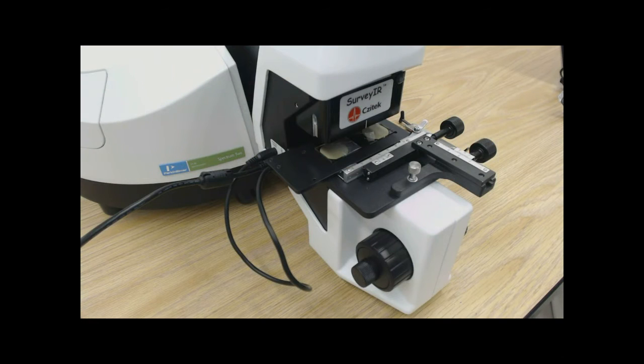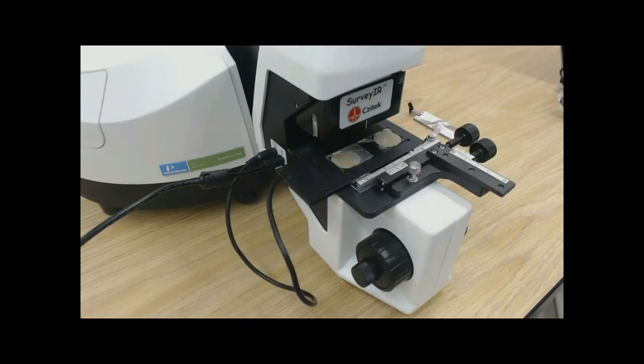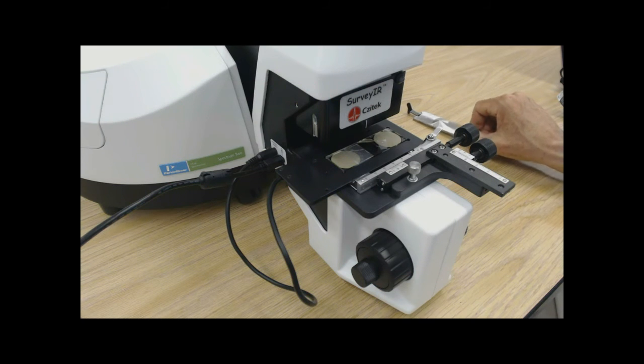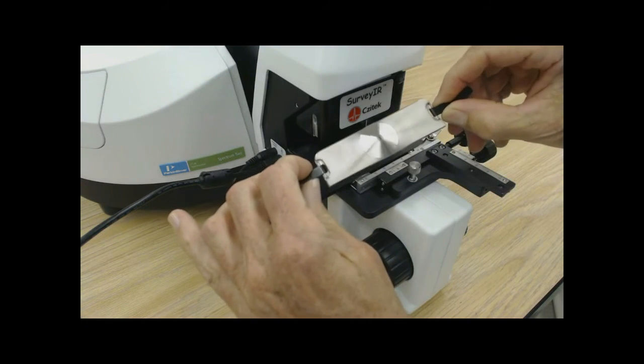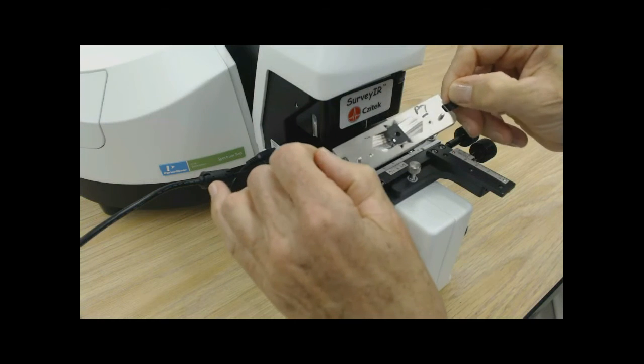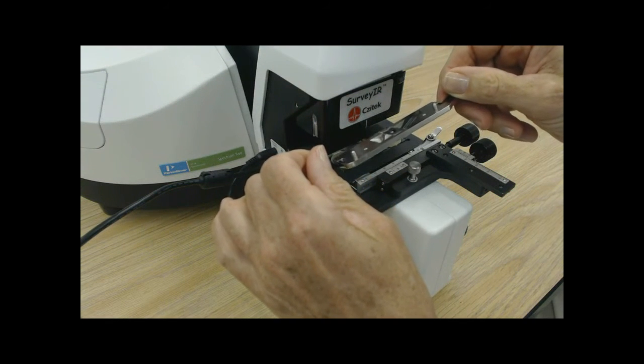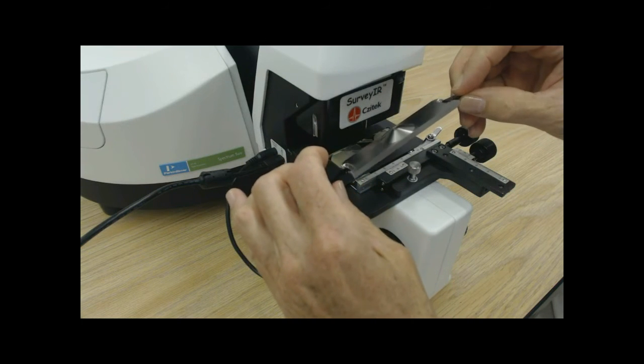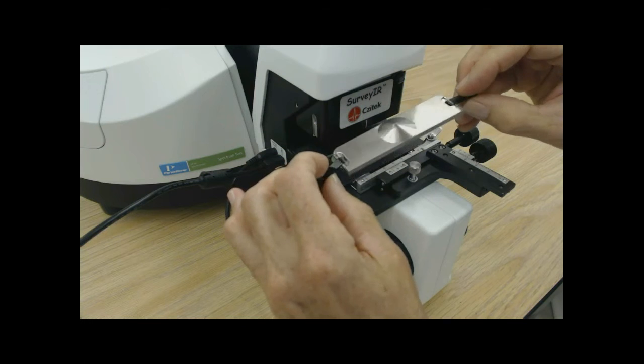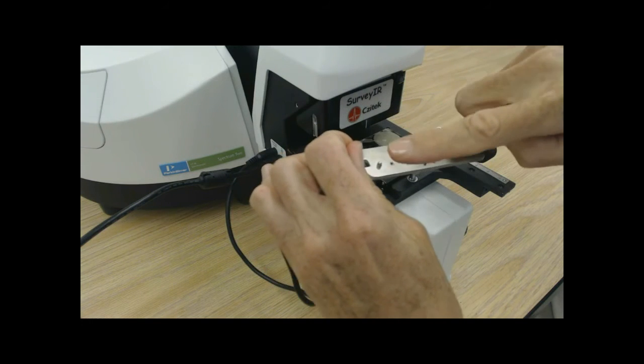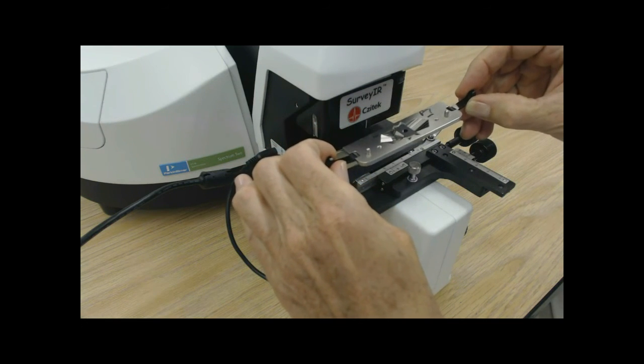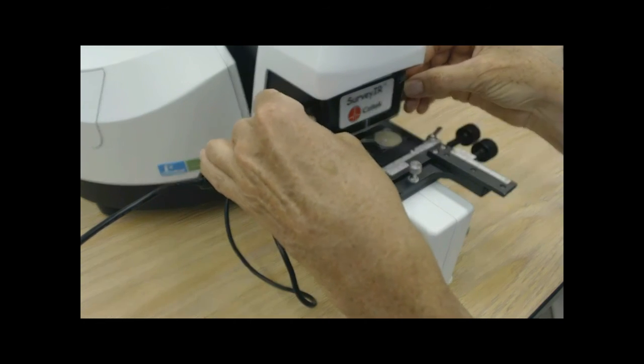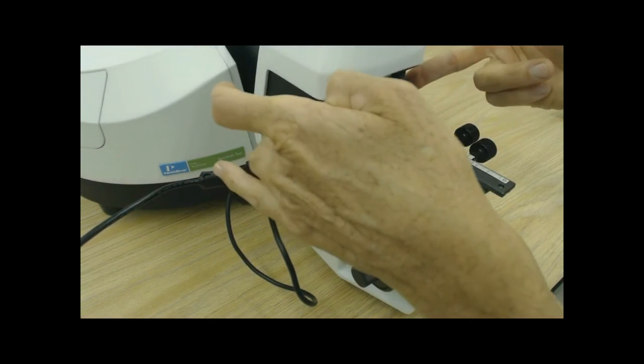Electrical and data connection is completed by connecting to your computer. For attenuated total reflection micro analysis, we will show you the installation of the Diamond ATR internal reflection element. The Diamond ATR element is secured into a stainless steel mount. It is optically and mechanically located by precision pins to the underside of the surveyor objective. Lastly, it is secured in place with swivel clamps.